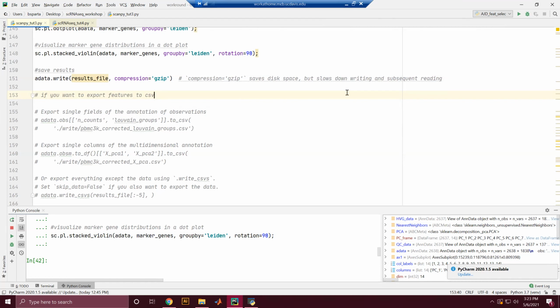If you get way more clusters than you expect to see, you could dial it down. Or more quantitatively, if you get a lot of clusters that are pretty similar, you can also reduce the number of partitions.